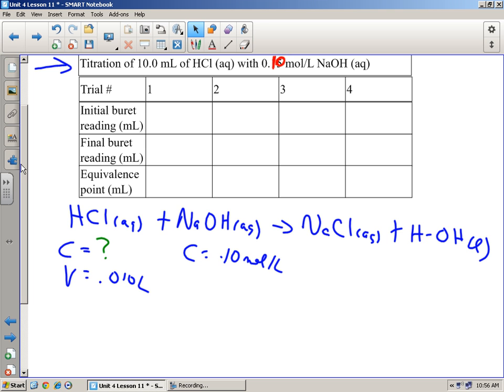Okay, so here's me, turning the valve on full way, okay, and let it go. And then once you get closer to zero, you can stop it. And what you'll see tomorrow is actually the air bubbles being forced out the bottom here. Now the tip is filled with my titrant, yes, and I need to get it down to zero now. So let's see here. Good.